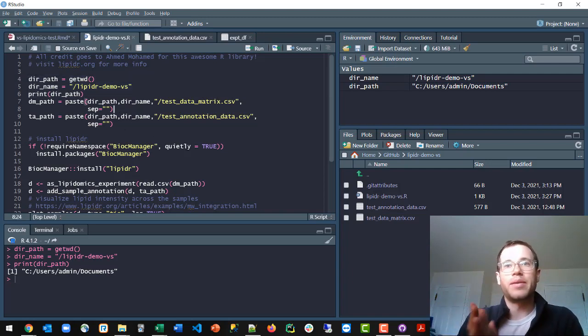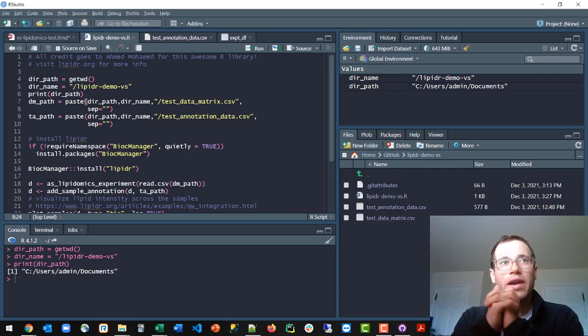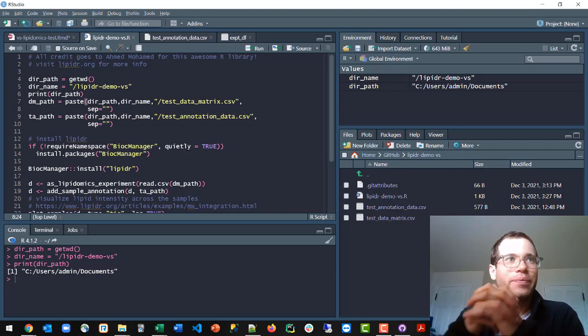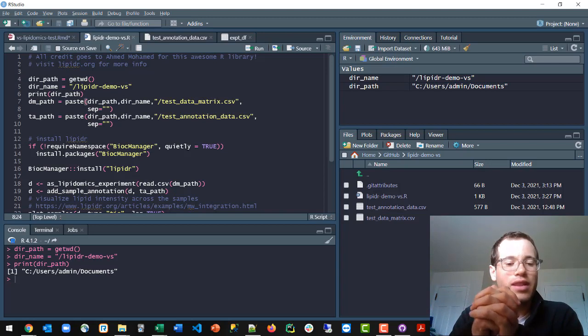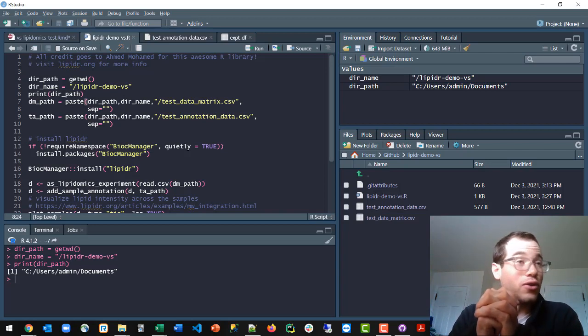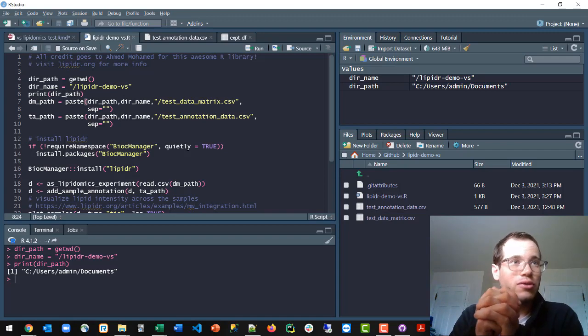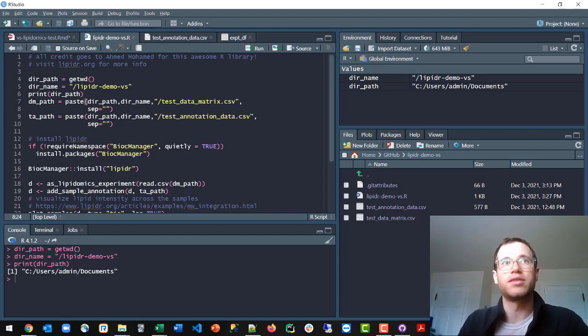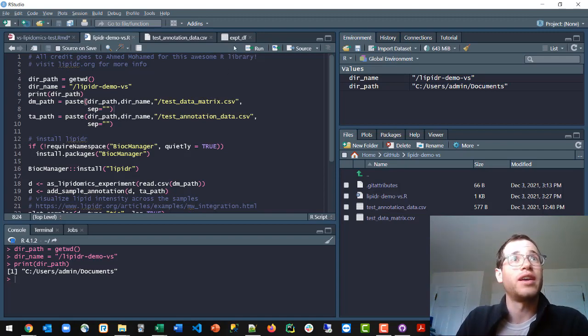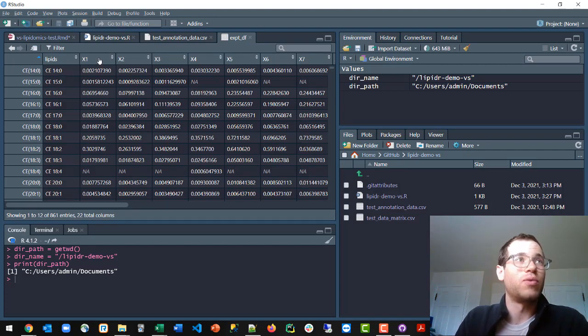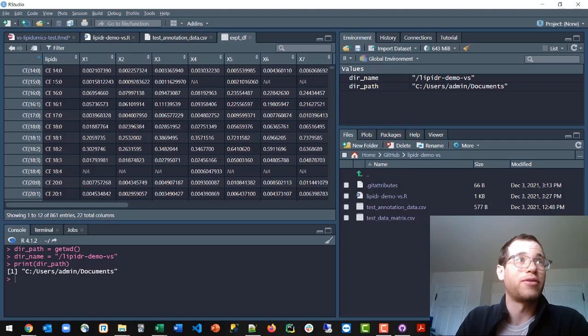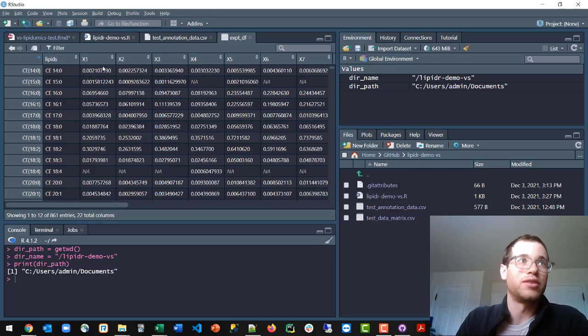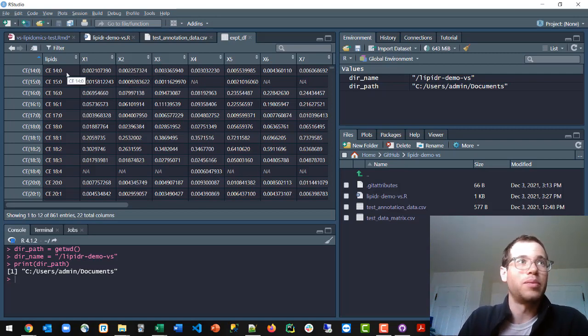When you are giving lipidr data, you're going to be giving it the actual values for all of your samples. So typically, one instance of this is going to be something like this, where in the experiment, each one of these columns, after the first column, maps to one of the mice in a study. And these values represent the concentrations of that specific type of lipid within that mouse.